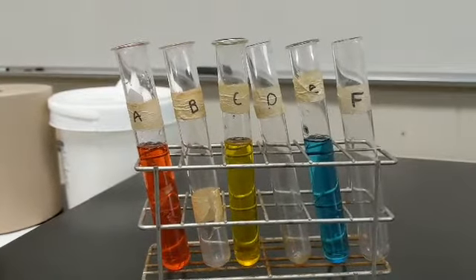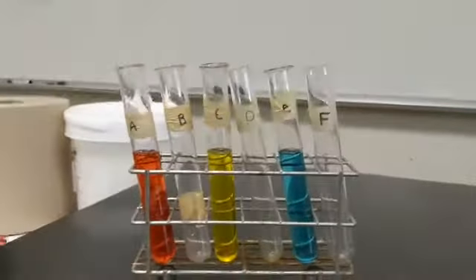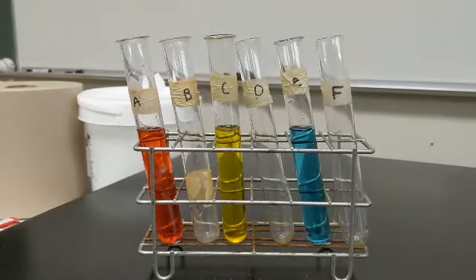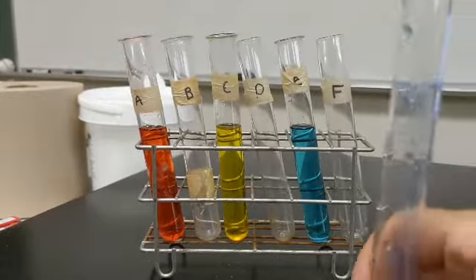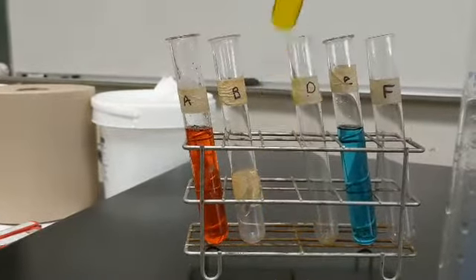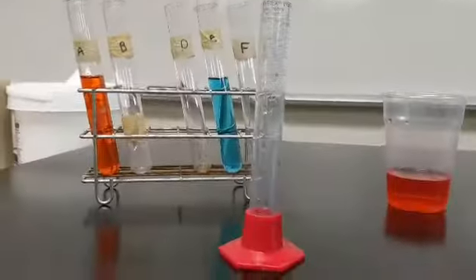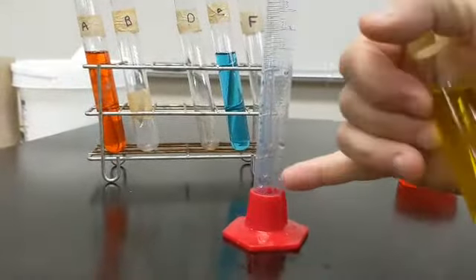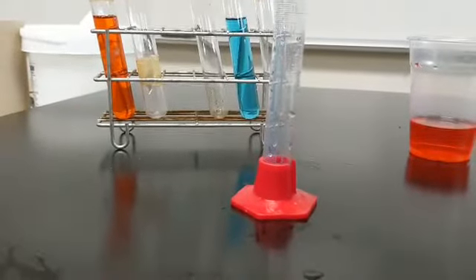All right. So the next step, it says, from test tube C, take 4 milliliters and pour the 4 milliliters into test tube D. All right, so we're taking out some yellow. So the 4 is way down here, so it's just a little bit.